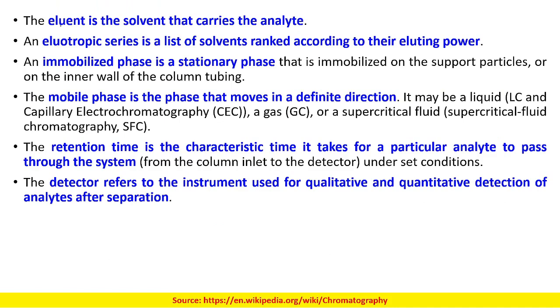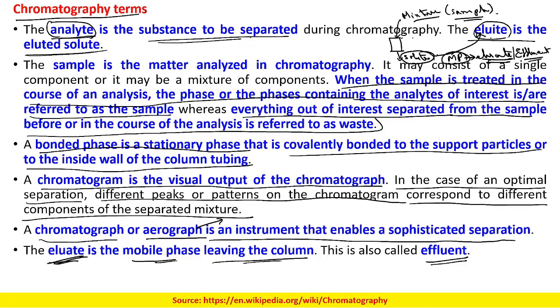Then the eluent is the solvent that carries the analyte. So when it is within the chromatographic system, it is called the eluent. When the mobile phase is within the system, eluent. When it is coming out, eluate.